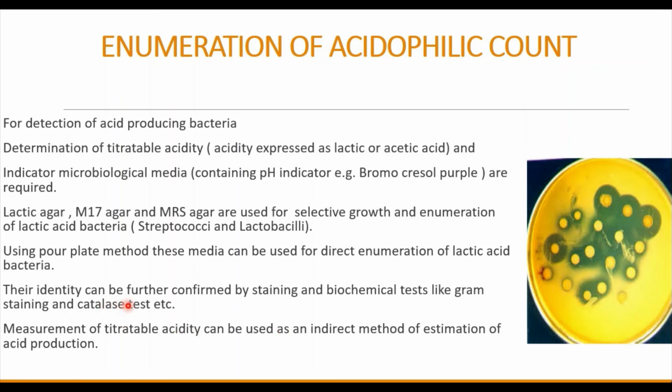Their identity can be further confirmed by staining and biochemical tests like Gram staining, catalase test, etc. So the measurement of titratable acidity can be used as an indirect method of estimation of this acid production. So this is all about the enumeration of acidophilic count.